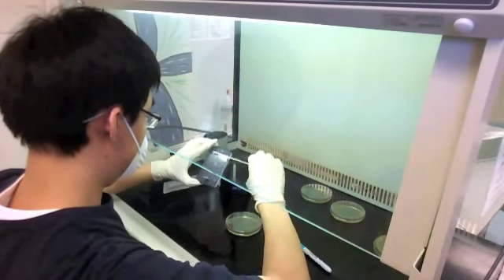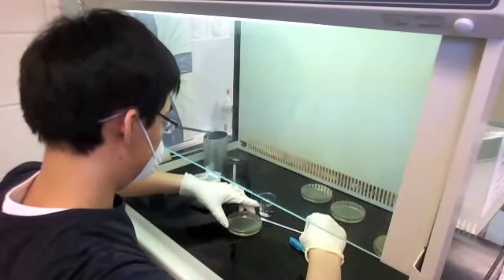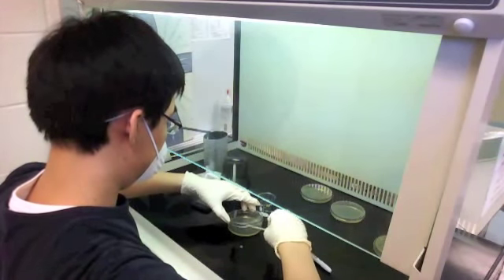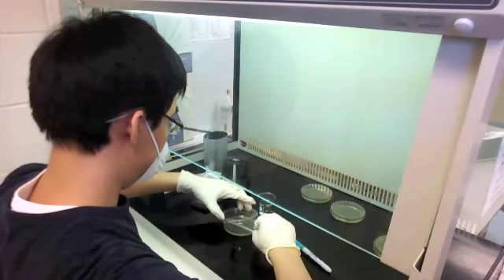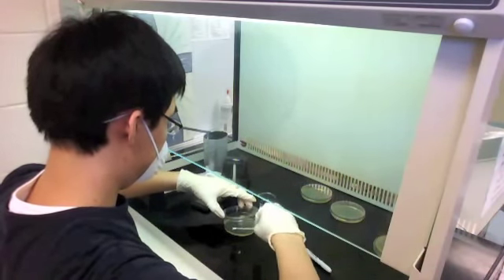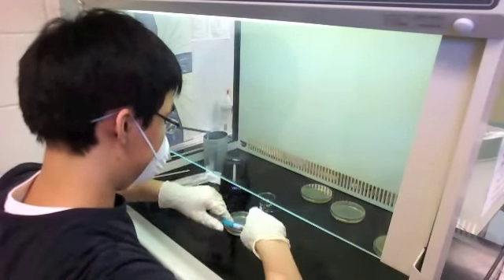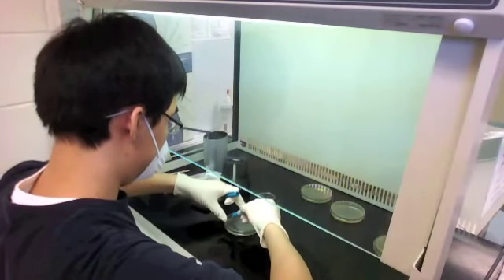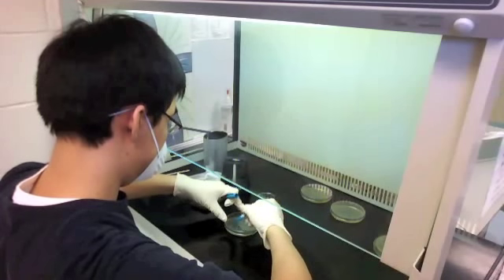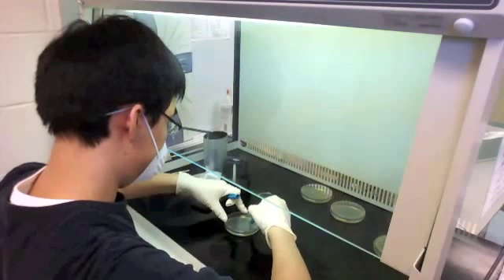Some of you might say the water could wash the bacteria off the first time, making the second swab have less bacteria — but no: I didn't touch the left side the first time. I only touched the right side and swabbed that side. I purposely left that half for the 'after' plate, which is what I'm plating right now. You'll notice I only lift the lid very minimally to reduce the chance of airborne contamination.